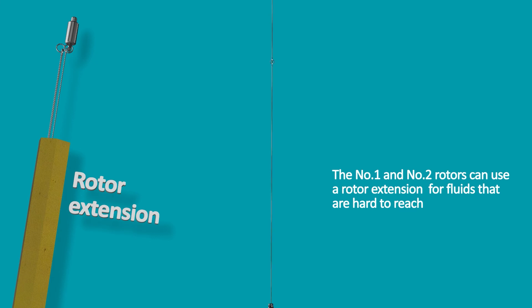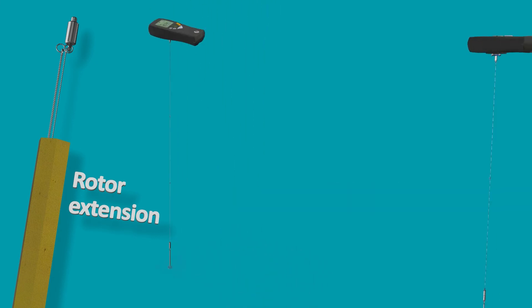The number one and number two rotors can use a rotor extension for fluids that are hard to reach.